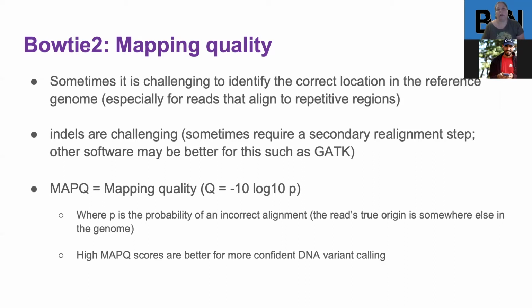Whereas if the quality of this read in that position is poor, then it's actually more likely to be a mismatch due to sequencing error or amplification error, and not a real single nucleotide variant. So it's a pretty complicated algorithm, and fortunately Bowtie will do that for you.